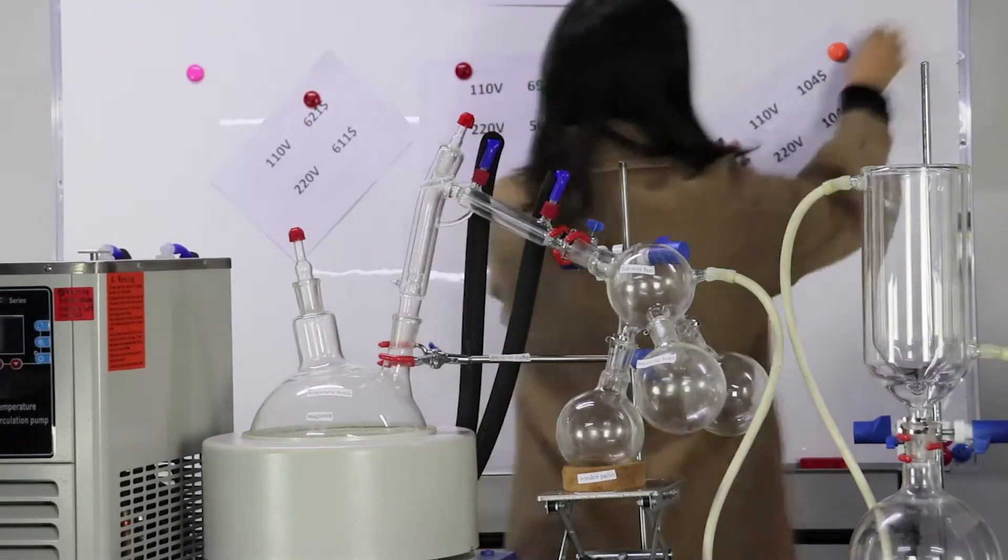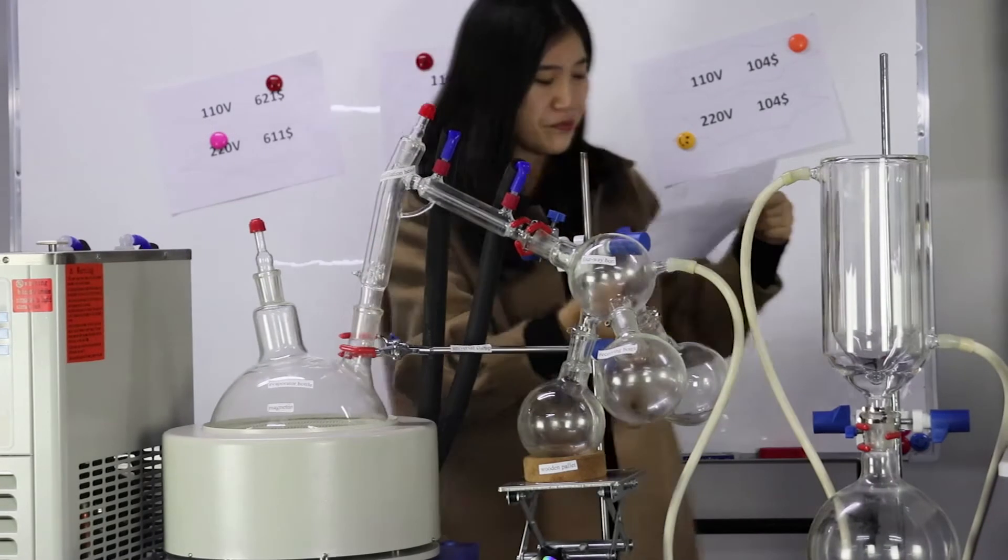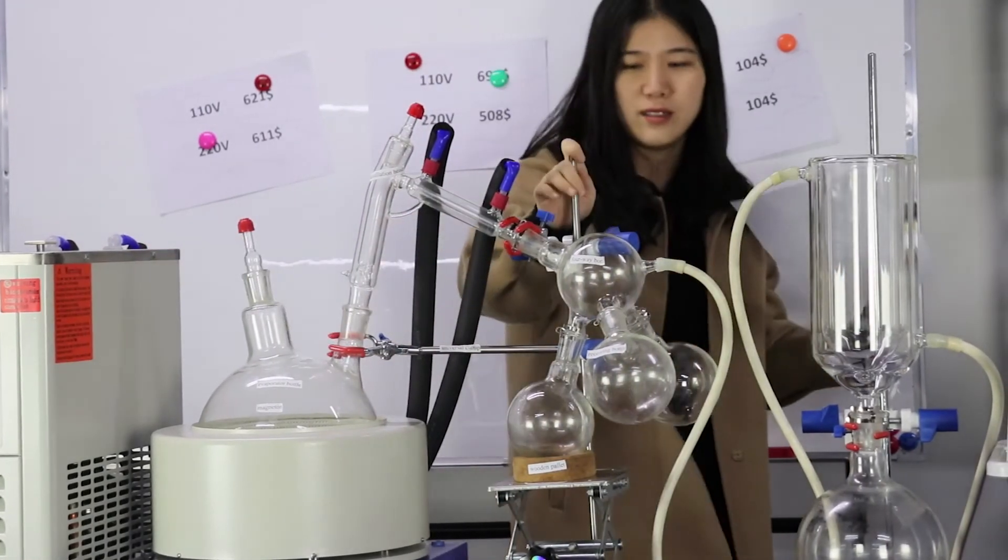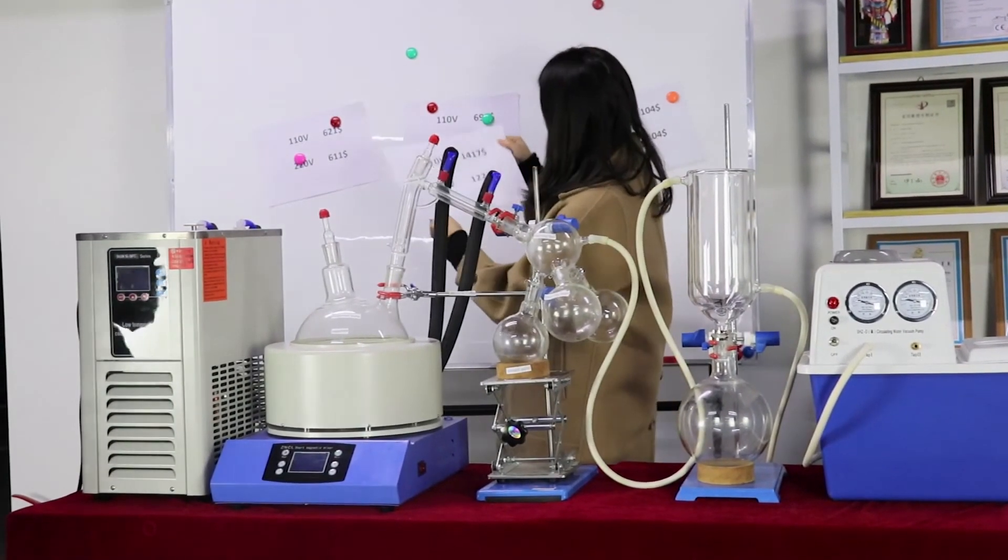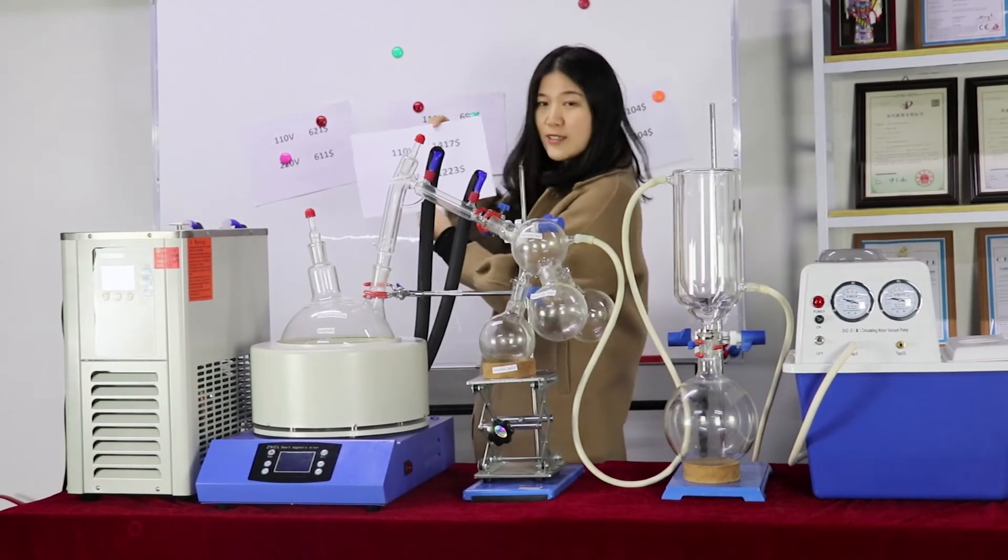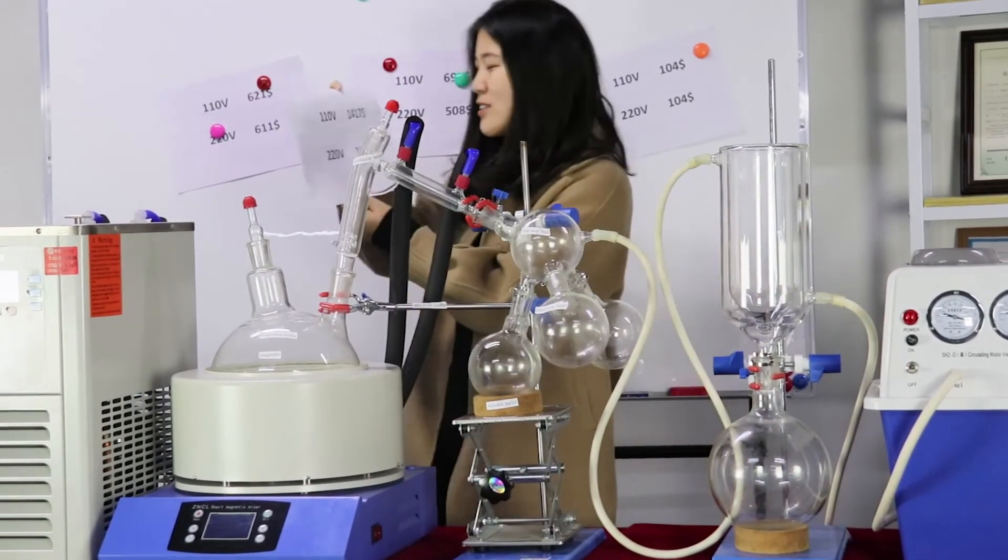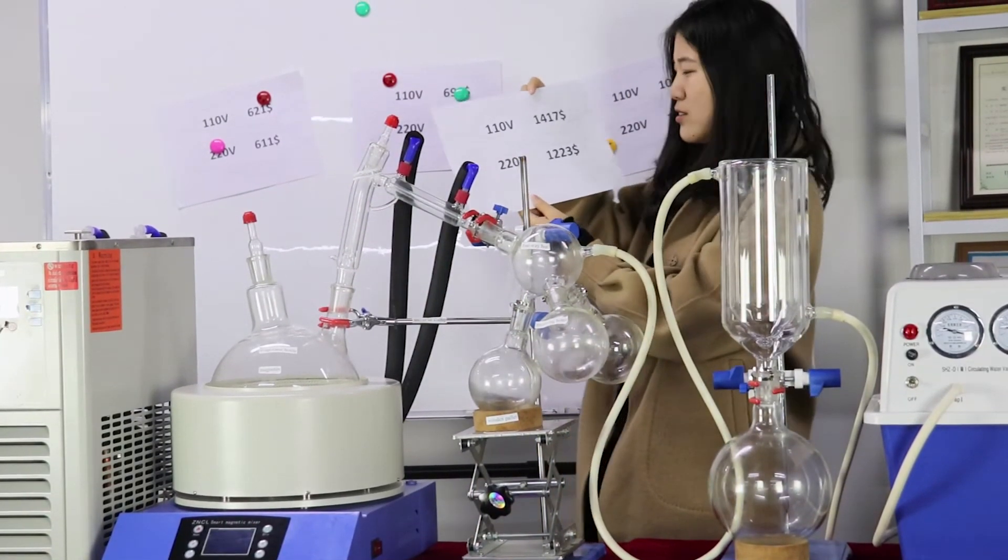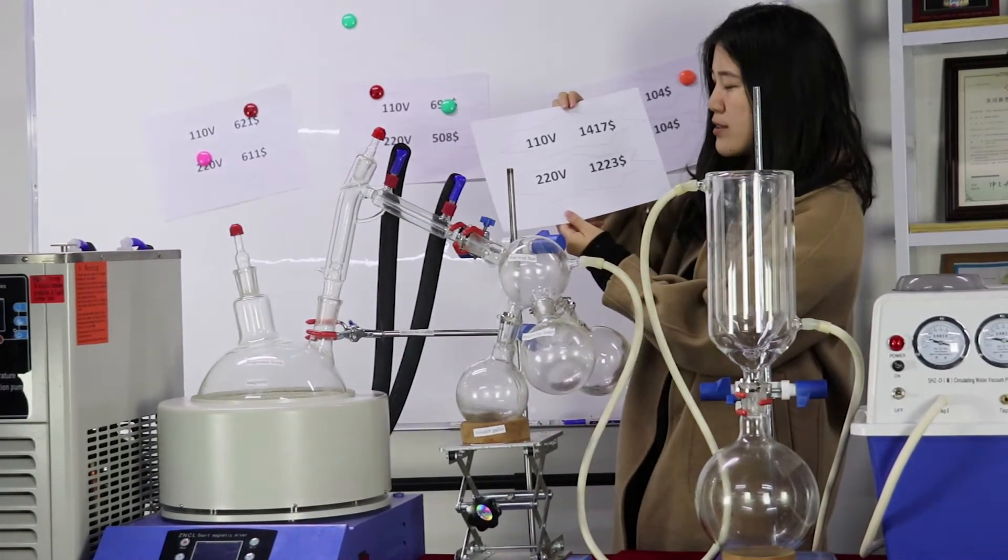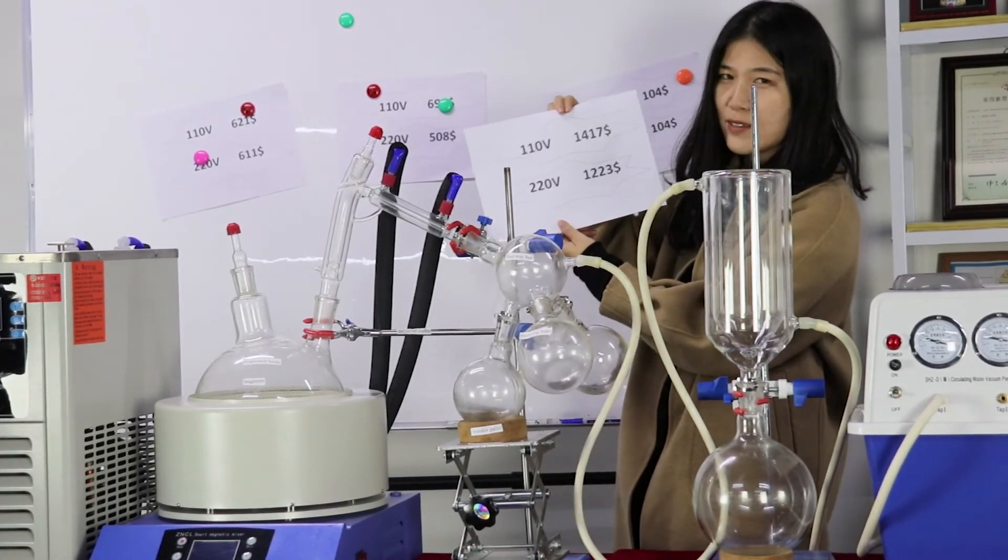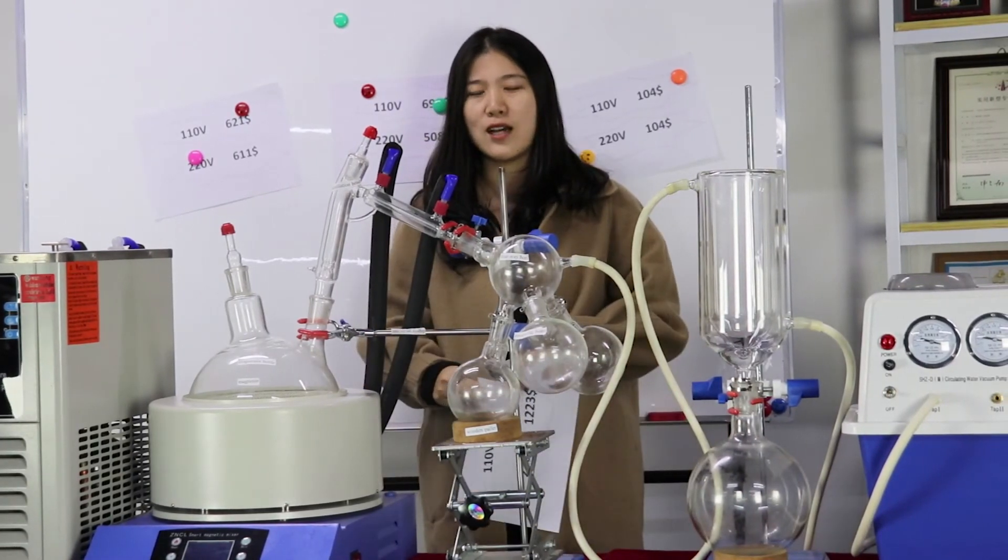How about the whole set? How about the whole set price? Very exciting too. The whole set, chiller and the distillation system and the vacuum pump, you just need to pay $1,223. If you need it right now, please contact us through Facebook.